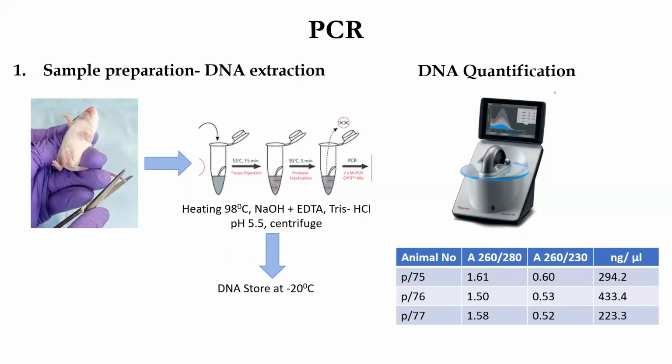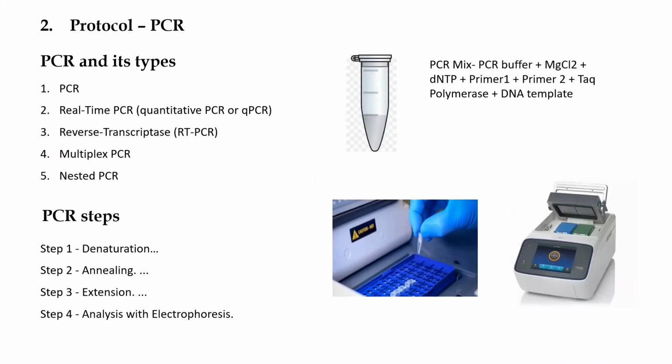Once you are sure that yes, the sample has DNA, you go ahead with the PCR reaction, that is, polymerase chain reaction. PCR is basically, you have a DNA and you amplify the gene of your interest.